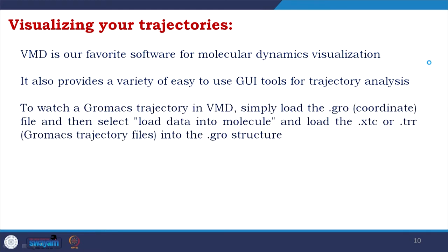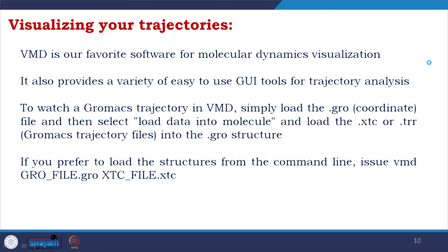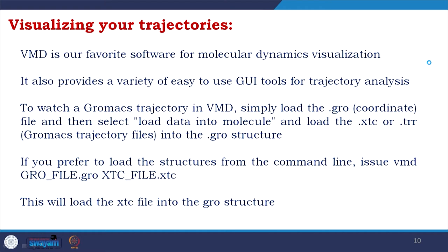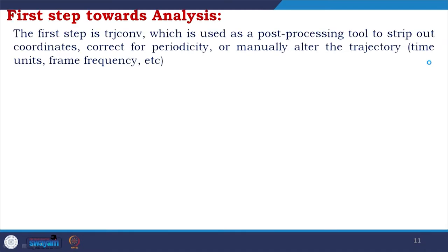To watch a GROMACS trajectory in VMD, first you load the .gro file, then select 'load data into molecule' and load the .xtc or .trr file. I prefer .xtc because of the reduced file size. You can also load from the command line: issue 'vmd gro_file.gro xtc_file.xtc' and this will load the .xtc file into the .gro structure automatically so you will see the outcome of the trajectory.